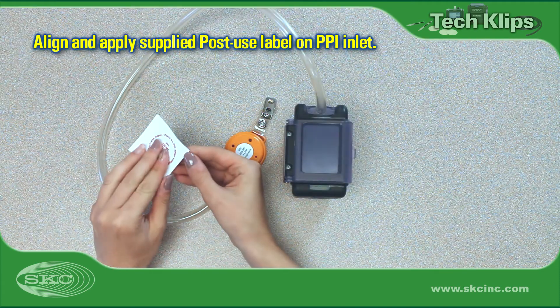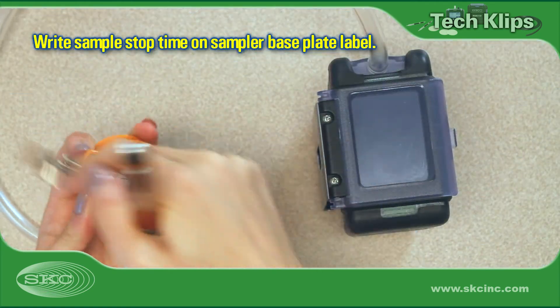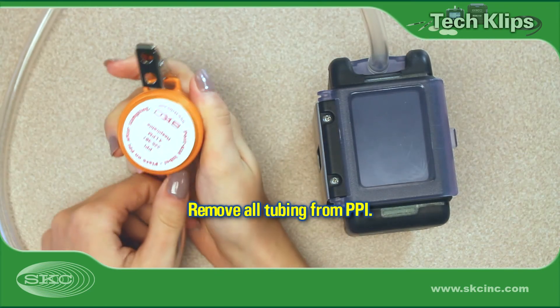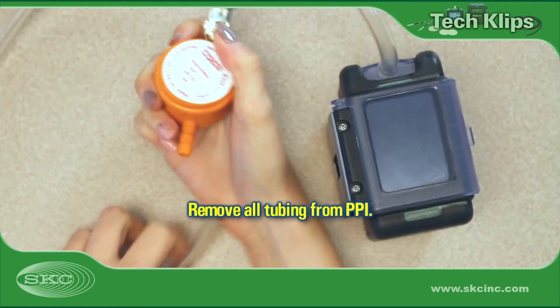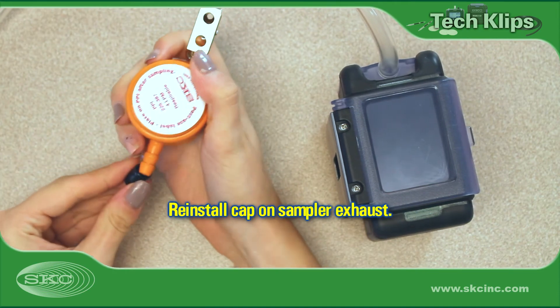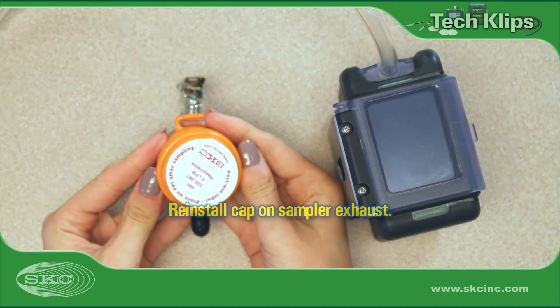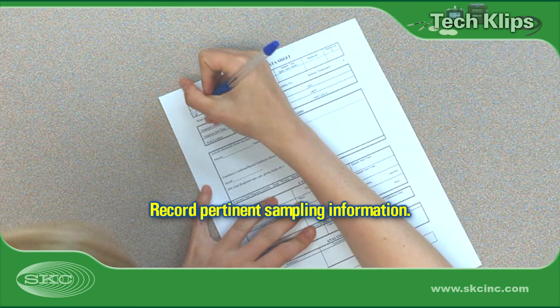Seal the PPI sampler and record the sample stop time on the label on the bottom of the sampler base plate. Pull all tubing from the PPI sampler and press the protective cap onto the sampler's exhaust. On a sampling sheet, record pertinent sampling information such as sample start and stop time, flow rate, temperature, and atmospheric pressure.